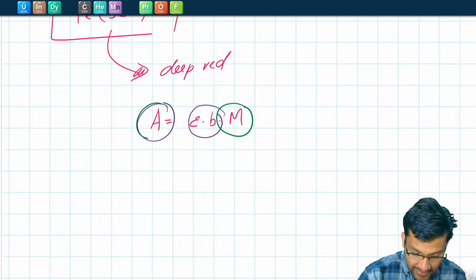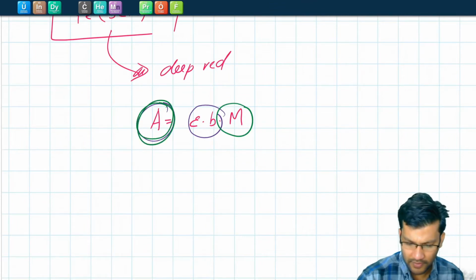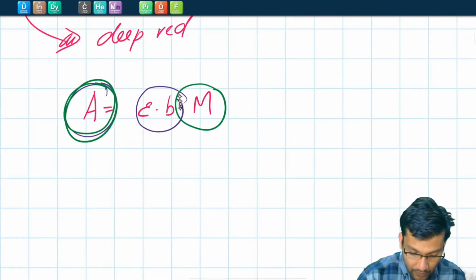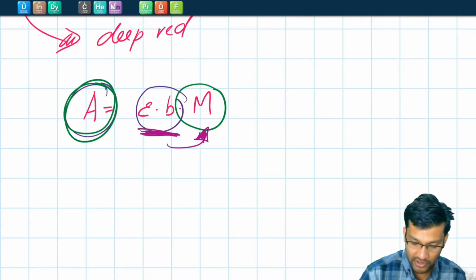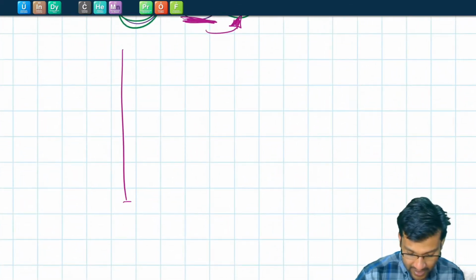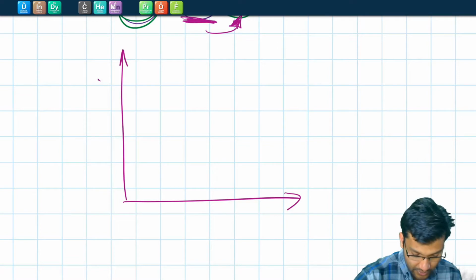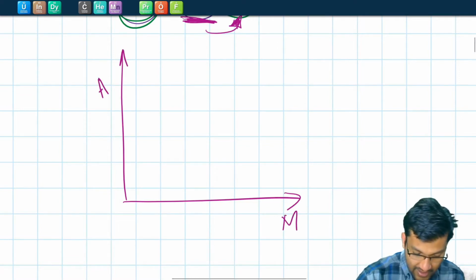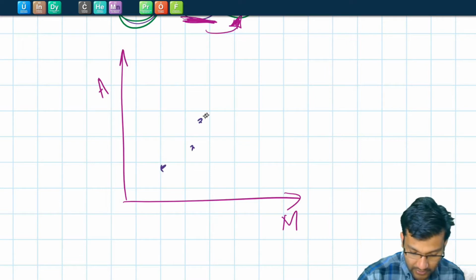Now, here's the thing. We can easily find the absorbance of a sample, right? We just put it in our little spectrometer that we've used before. But we need to figure out what these constants are before we can go ahead and find the concentration of the solution. We've done this before by plotting a graph of absorption on one axis and the concentration in molarity on the other axis. So we'll get a bunch of samples and we'll plot a graph.